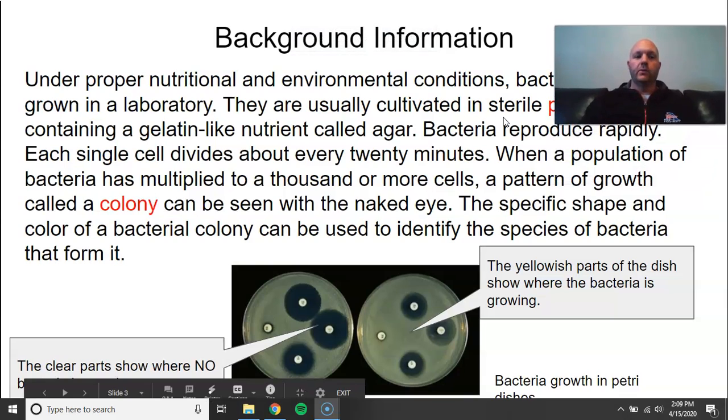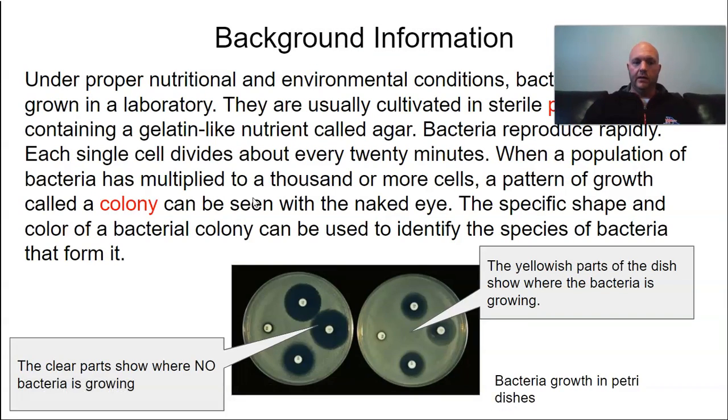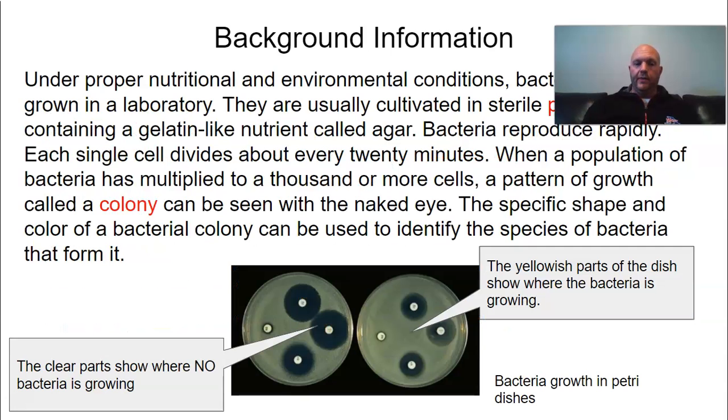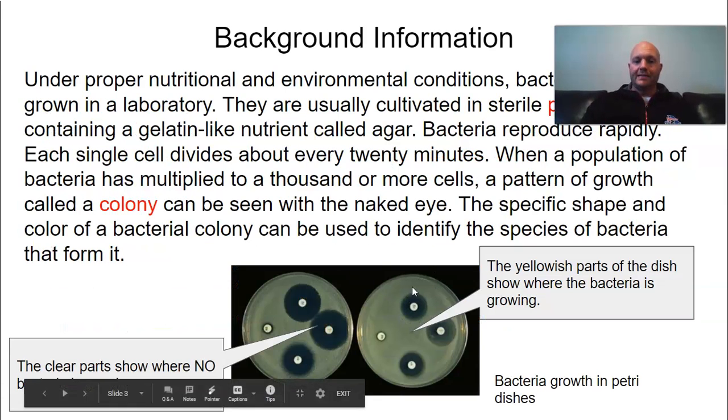All right, if you are growing bacteria on an agar plate, right? Bacteria, by now you should know, are little prokaryotic, which means single-celled, no nucleus, organisms, and you can grow them pretty easily on the agar cubes you use when you do that cell size lab where you cut them into little pieces. If you grow bacteria on that and then put one of these discs on it, this area here has no growth of anything.